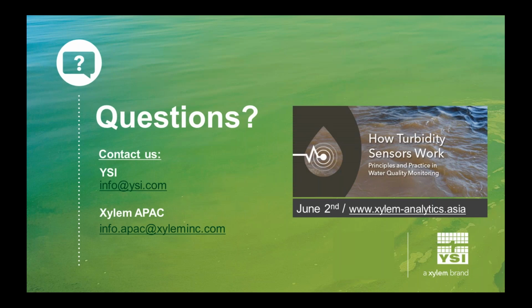So that was a case where they wanted to monitor the influx from a river of blue-green algae that normally would not have been present. Now, it ends up, but in case you're wondering about this, you aquaculture folks, those toxins don't really biomagnify in the tissues of the fish. So it ended up not being as much of a health concern as they had thought.